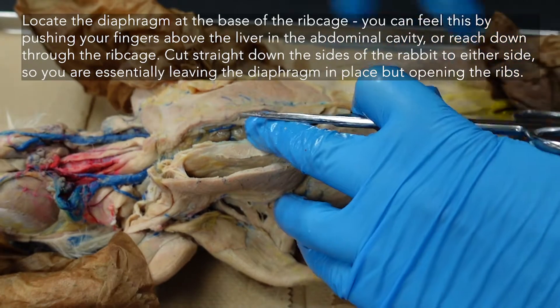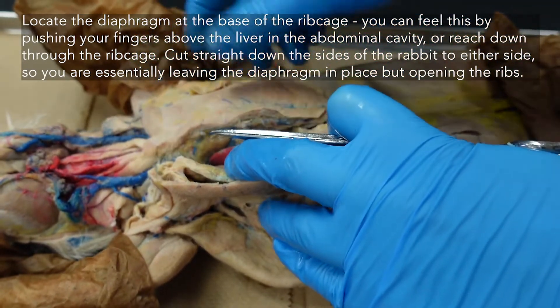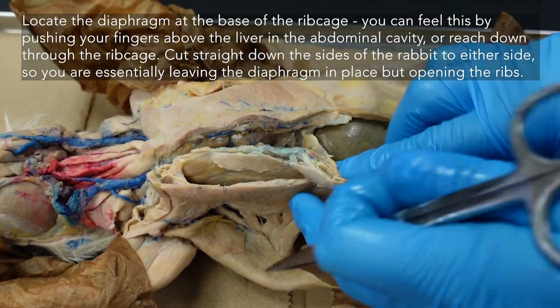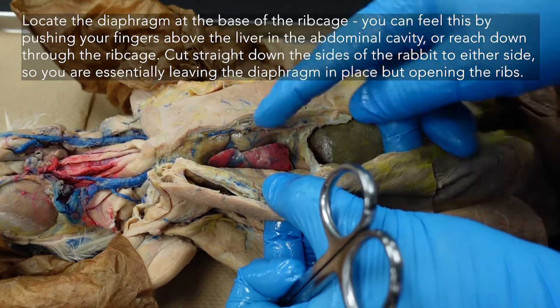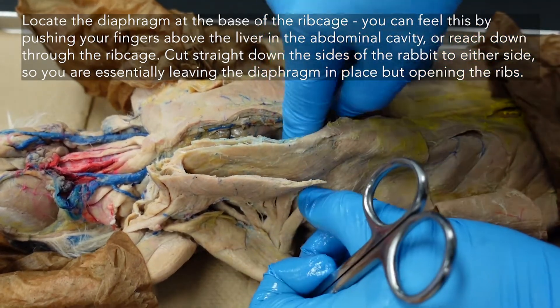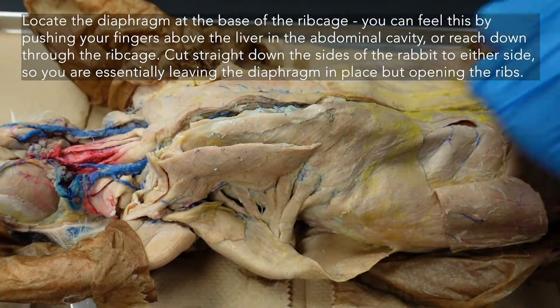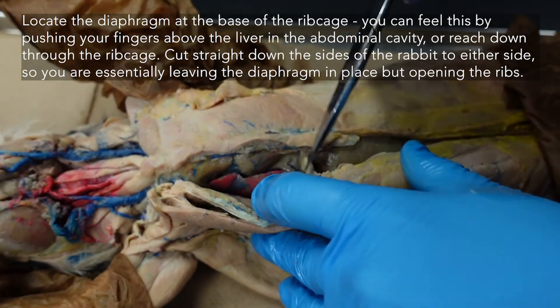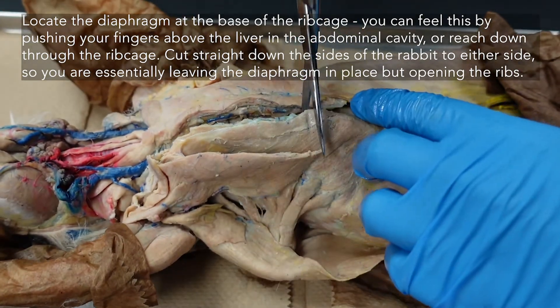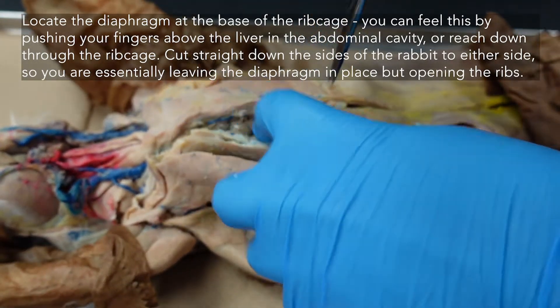After you have cut all the way up to your manubrium, we will eventually be removing some of this muscle and opening everything up. We can see our diaphragm right here between our lungs and liver. Let's cut around there so that the two halves of the ribcage can open up but leave the diaphragm in place. I'm peering down making sure I'm not cutting the diaphragm — I'm cutting in front of it, cranial to the diaphragm, just straight down on either side.